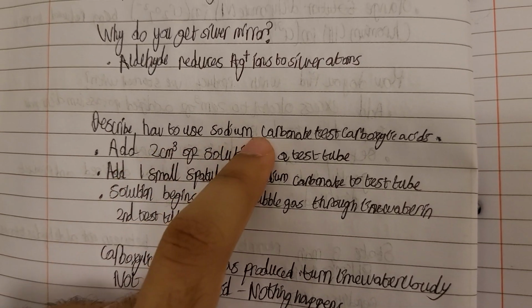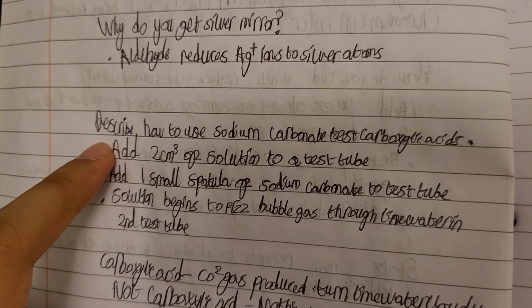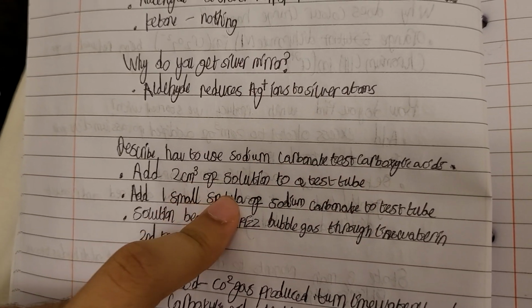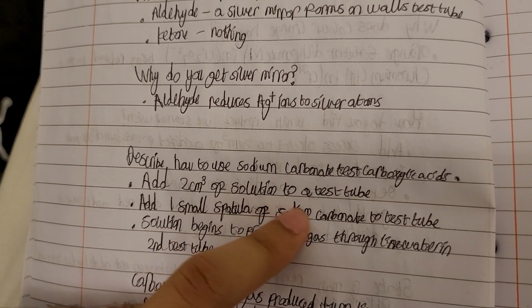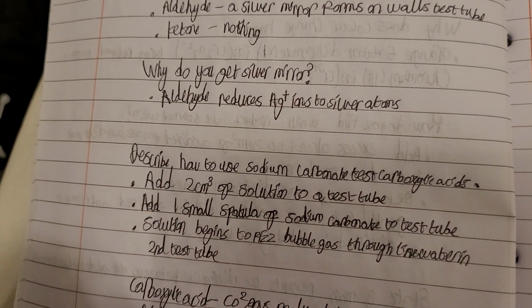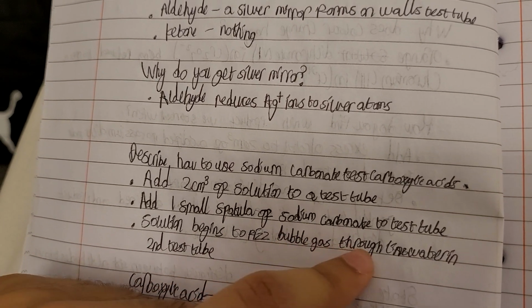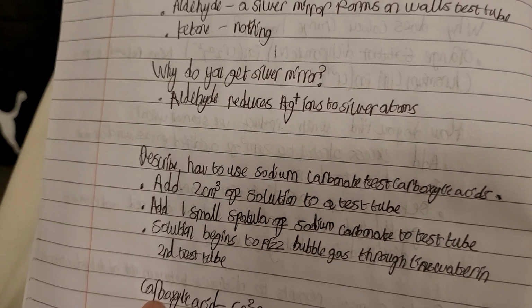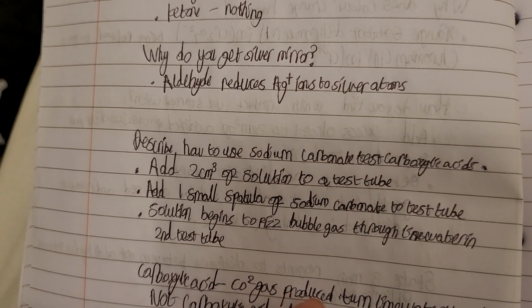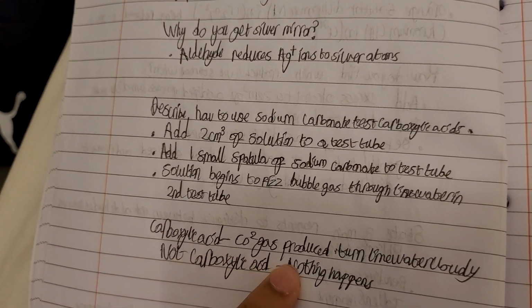So, describe how to use sodium carbonate to test for carboxylic acid. Add 2 centimeters cubed of the solution we want to test to a test tube. Add one small spatula of solid sodium carbonate to the same test tube. If the solution begins to fizz, bubble the CO2 gas produced through lime water in a second test tube. If it's a carboxylic acid, the CO2 produced will turn the lime water cloudy. If it's not a carboxylic acid, nothing happens.